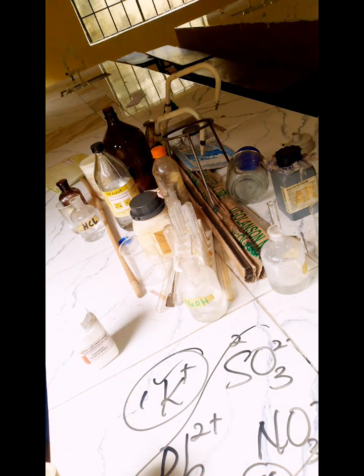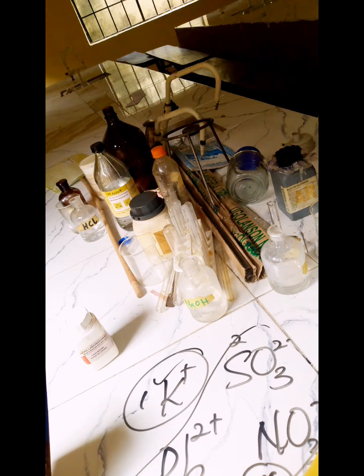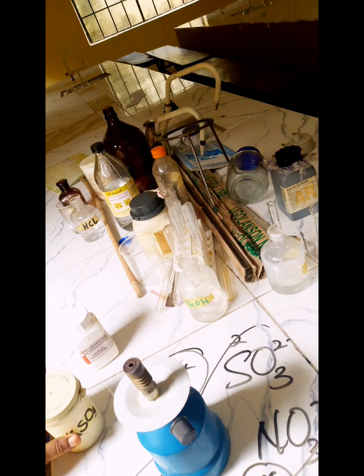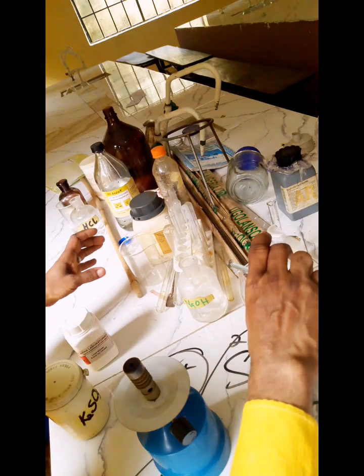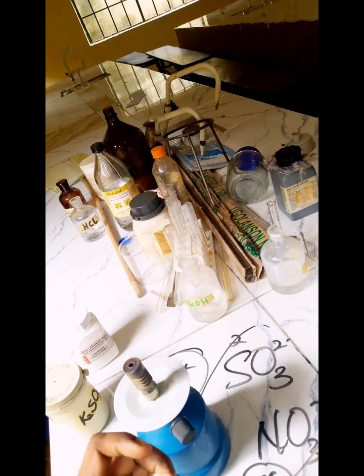Here is the salt containing potassium, and here is our source of flame. Here is a glass rod, and I have concentrated hydrochloric acid which we'll be using.